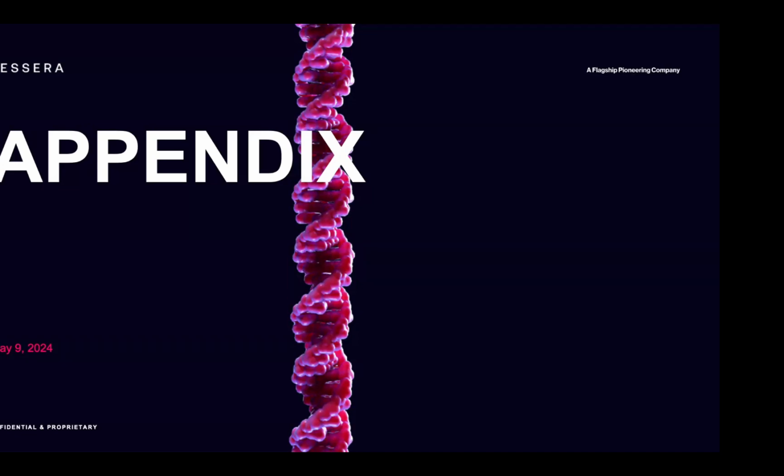If it comes back with an error, it lets the user know, you have conflicting indexes, you need to move them to different lanes or different runs. But if there's no issue, it spits out the index sheet. You store it in S3, but give them a download of it so they can bring it home to the sequencer. So that's how it works in a real case example. But yeah, it's all in Git. We all use the Serverless Framework to push our functions to the cloud.